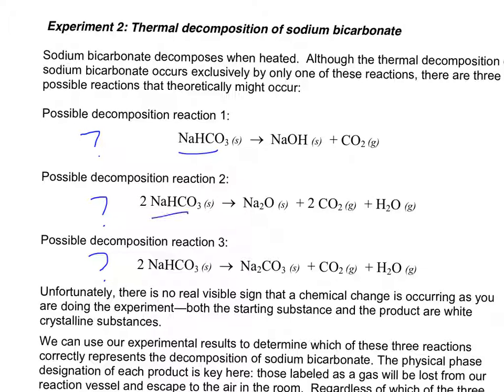In all cases, you have the same reactant, the NaHCO3 again, and in all cases, you're going to apply heat. Honestly, I'll just tell you, so we're all on the same page, you are going to weigh back your product, and you're going to see if the mass is this, or if the mass seems like it is this, or if the mass seems like it is this. I don't know if that makes sense, but I'll talk you through it. So it's an exploratory sort of thing.